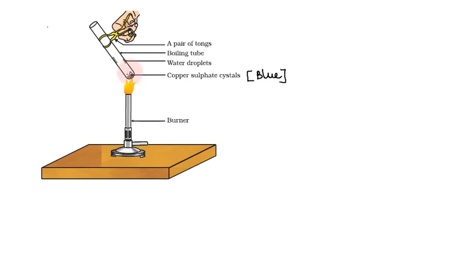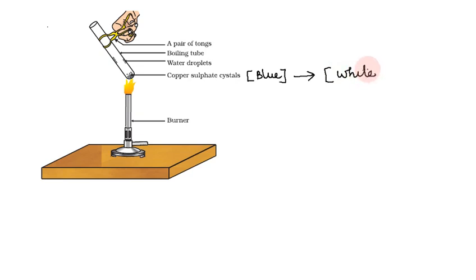We have the water removed. We will show you water droplets in the inverted test tube. This is the copper sulfate crystal. We will observe it change color — it will change to white.